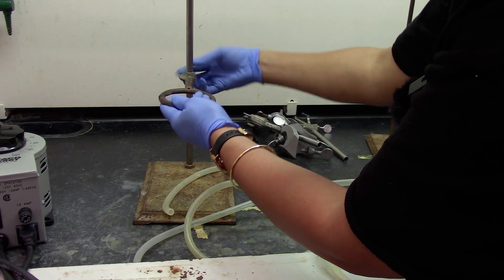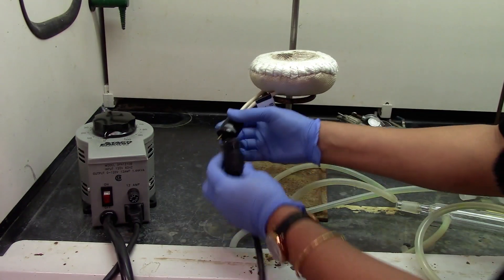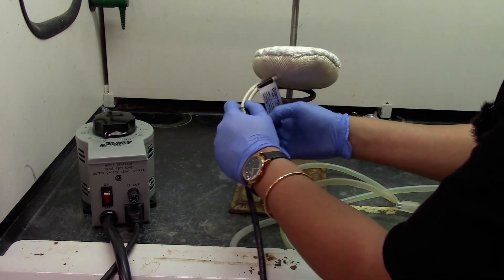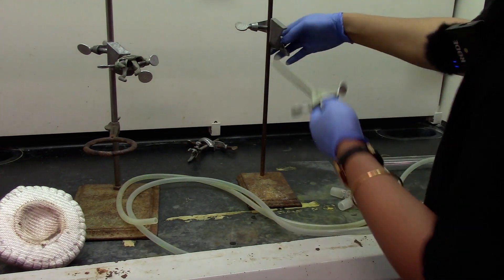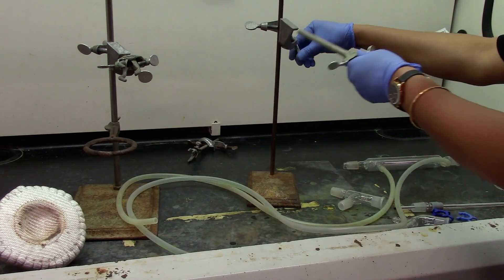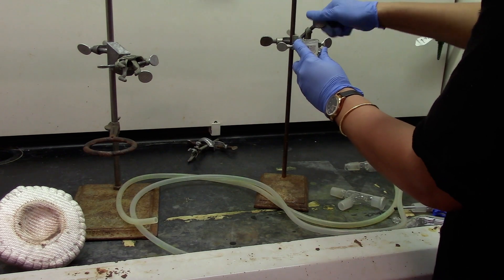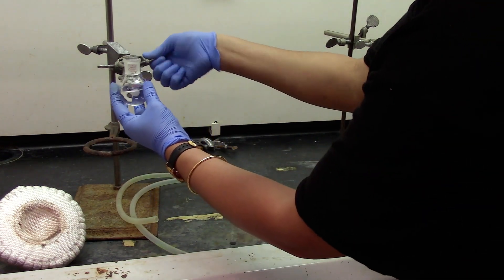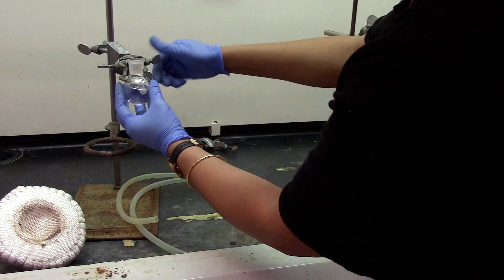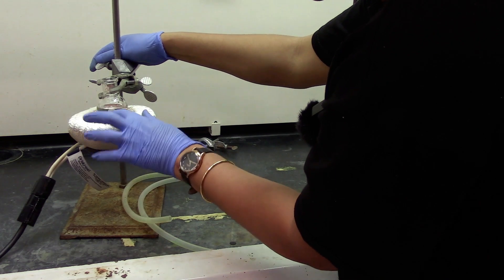We are going to attach a ring clamp onto the ring stand which will be for the mantle. Connect the mantle with the variac. We need another ring stand for a clamp to hold onto the collection flask, which is our 25 ml round bottom flask. You need a boiling stone into the 50 ml round bottom flask. Then we will have it clamped on the ring stand. The mantle will be sitting on a ring clamp and now we are bringing this down to have it sit onto the mantle.